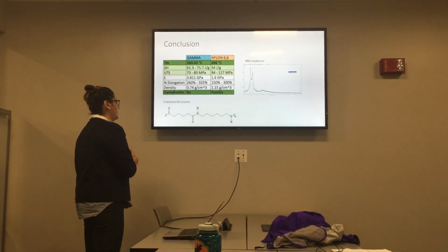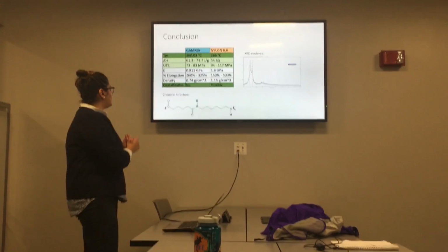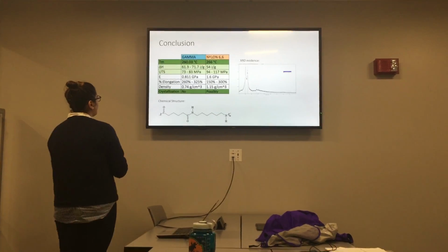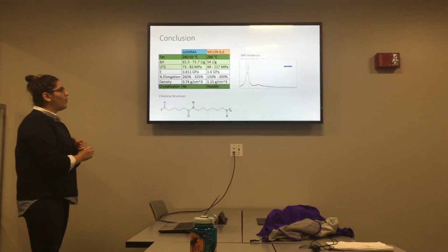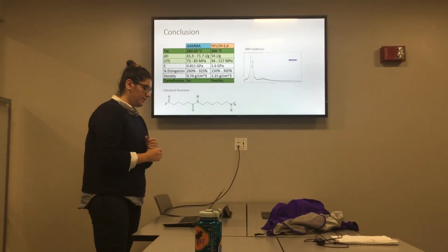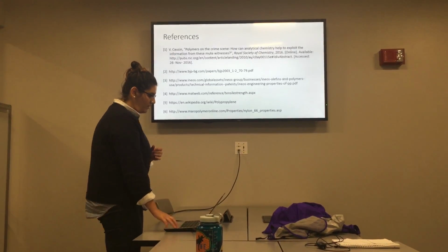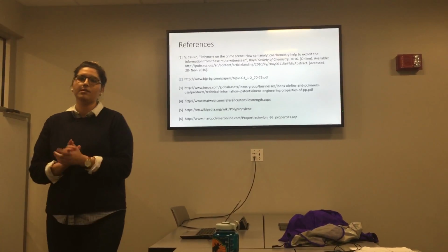We think XRD is really good data. We're also pretty happy about the delta H and the UTS. Again, they're not as spot on as the melting temperature or XRD, but we think there's ample evidence to suggest that it's nylon 6,6. References, can I answer any questions?